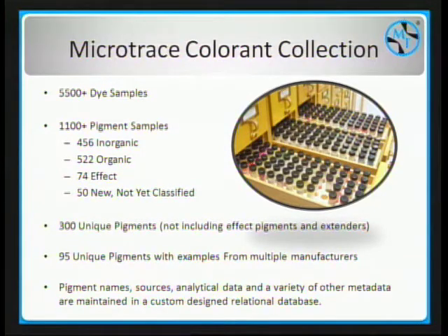We really focused, there's over 300 unique pigments, not including the effect pigments and the extenders. And we really tried to focus on not necessarily the artistic pigments, because those have been well classified. There's some overlap, of course, but we've really tried to focus on things that were of more industrial use. So, and everything's in a database that we started many years ago, and now it's sort of all filled out nicely.